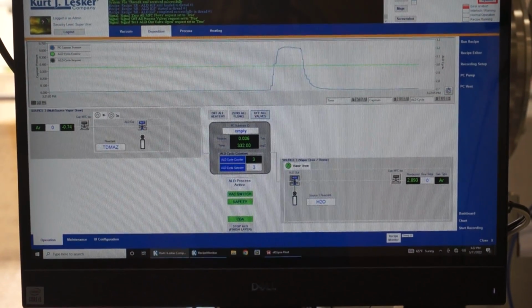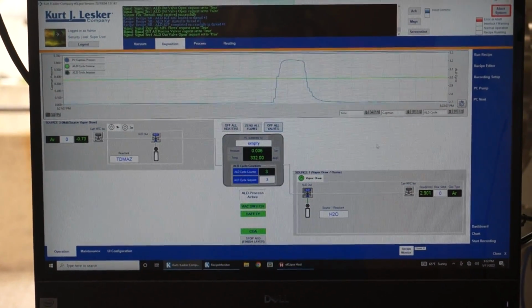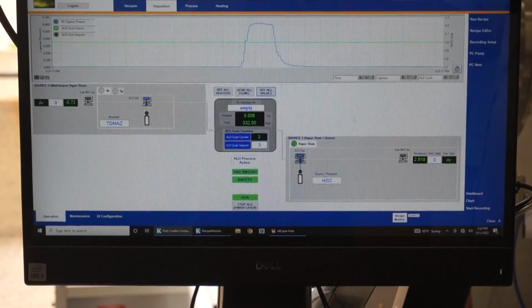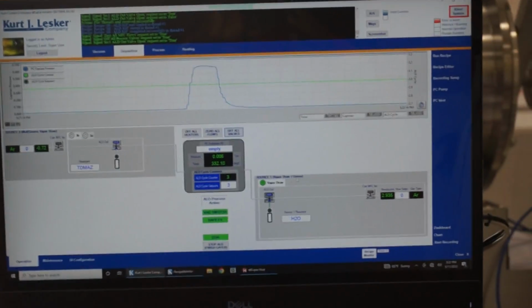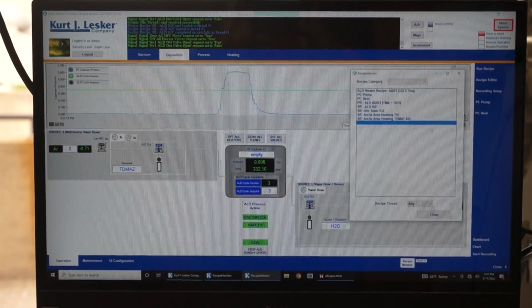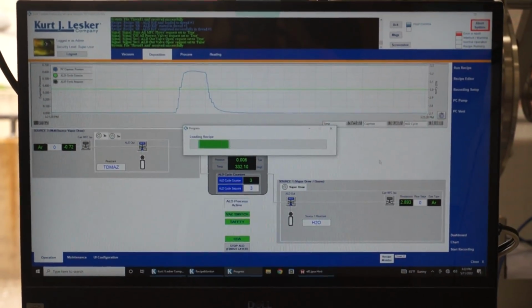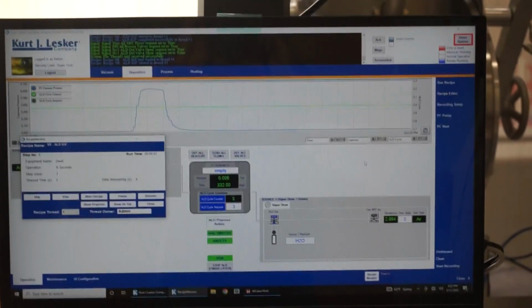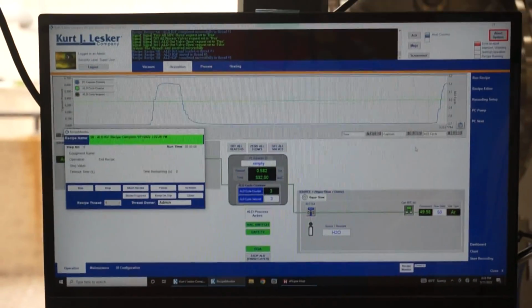Are those in the manual or something? It's a procedure. I'll give it to you here, or I'll put it on the desktop. After it returns there, you can shut that off and go back to here. So there's a procedure for loading and unloading the ampule, and there's a pump purge procedure. I will put both of those procedures on the desktop tomorrow.